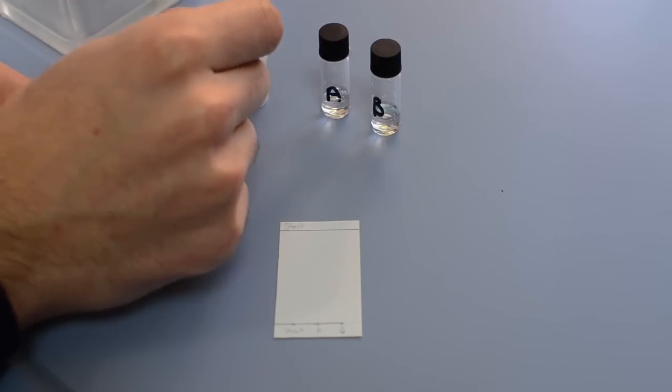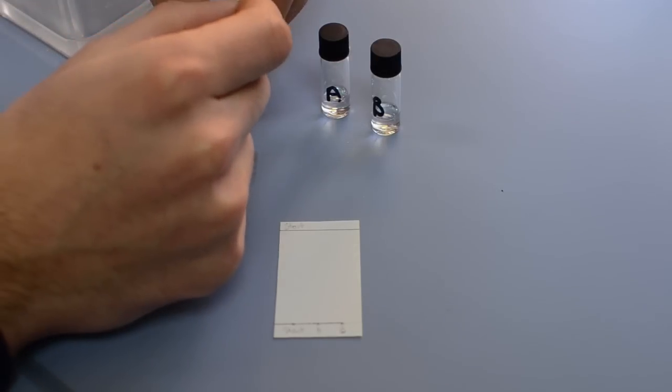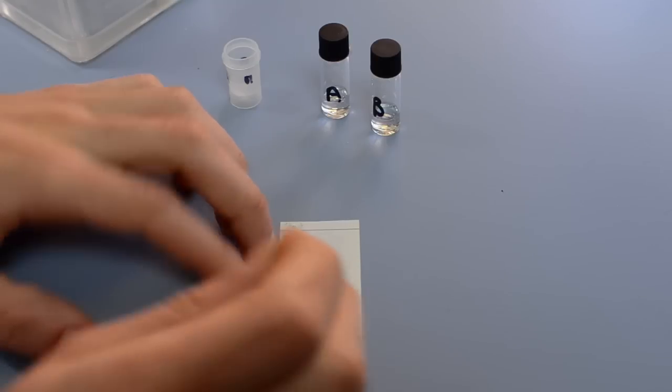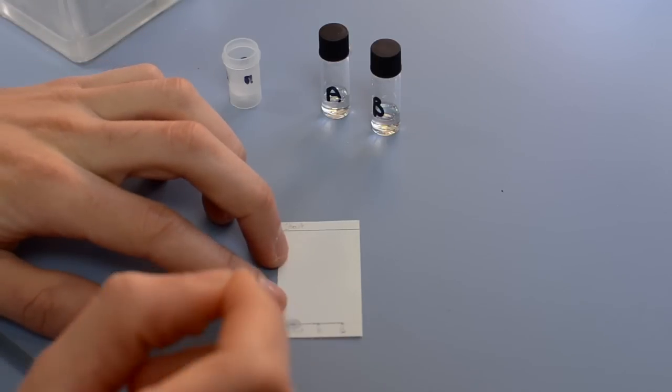Spot this next to your starting materials on the same TLC. Label each spot clearly. Develop the TLC after the run and identify the starting materials.